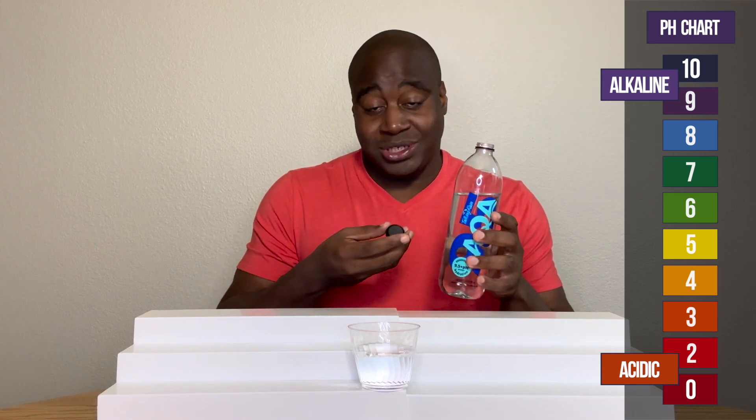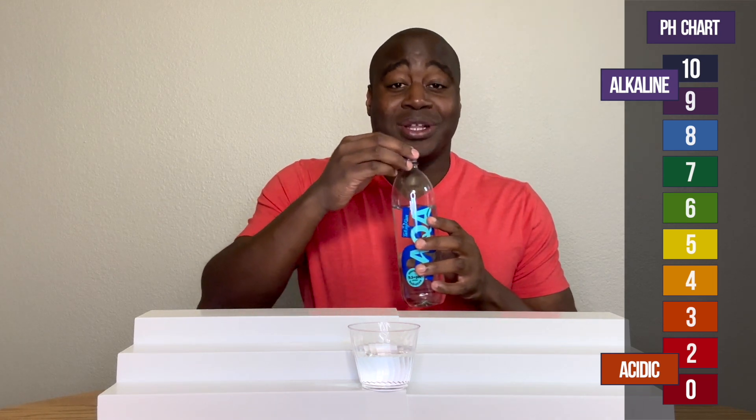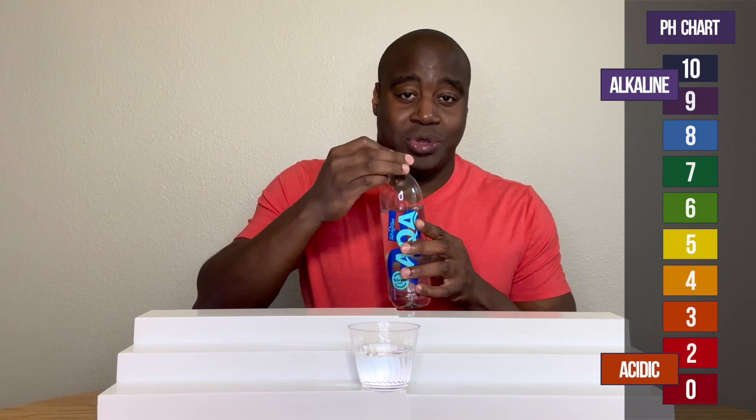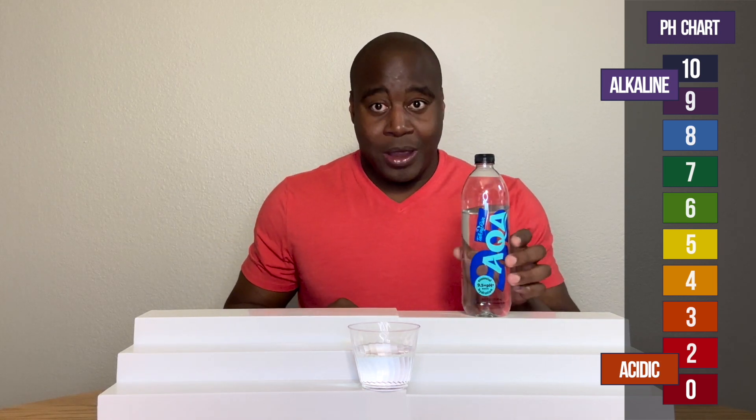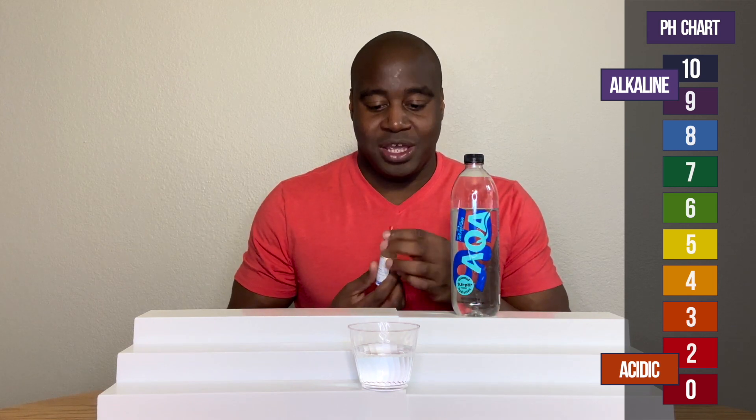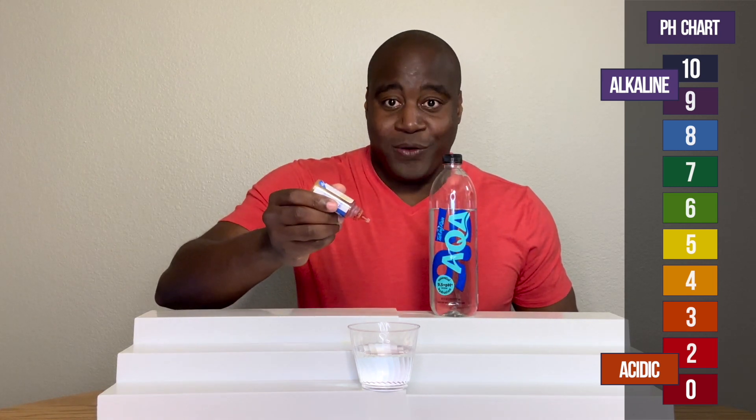And if it shows up alkaline, which I have a feeling it will, we're going to test it to see if it's truly strong at battling acidity. So let's see what we get here with Aqua's 9.5.